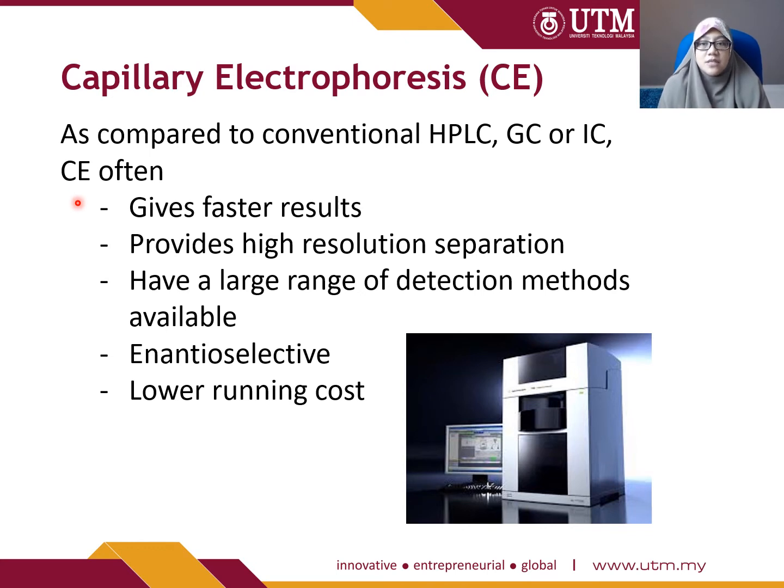First, CE usually gives faster results and good separation. Okay, we can get good separation with CE, and CE can provide high resolution of separation. Kiranya the resolution tu kita akan nampak dengan jelas dan dapat dikira all the information from the analytes properly. But sometimes the resolution ataupun the separation is not stable, or low reproducibility.